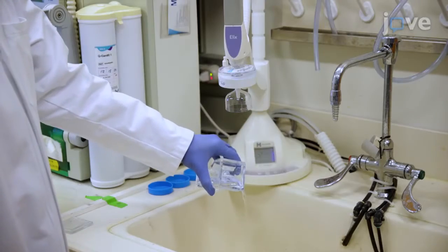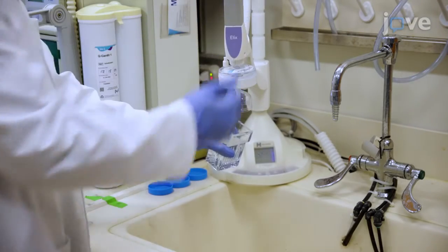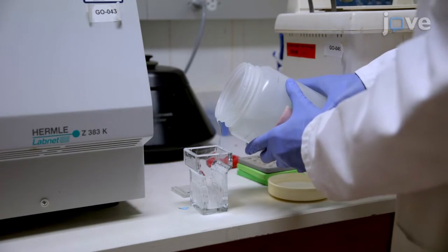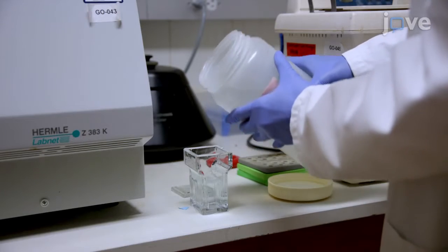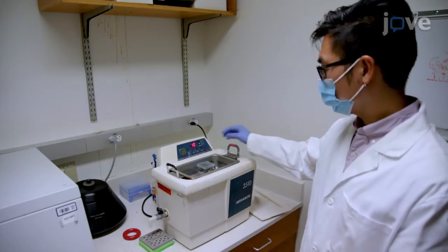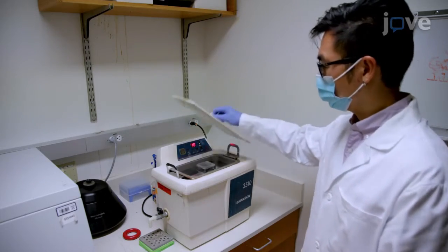Pour out the acetone and rinse the coverslips three times with distilled water. After repeating the sonication and acetone, fill the jar with enough potassium hydroxide to cover the coverslips. Sonicate the jar again, covered, for 20 minutes at 40 degrees Celsius.